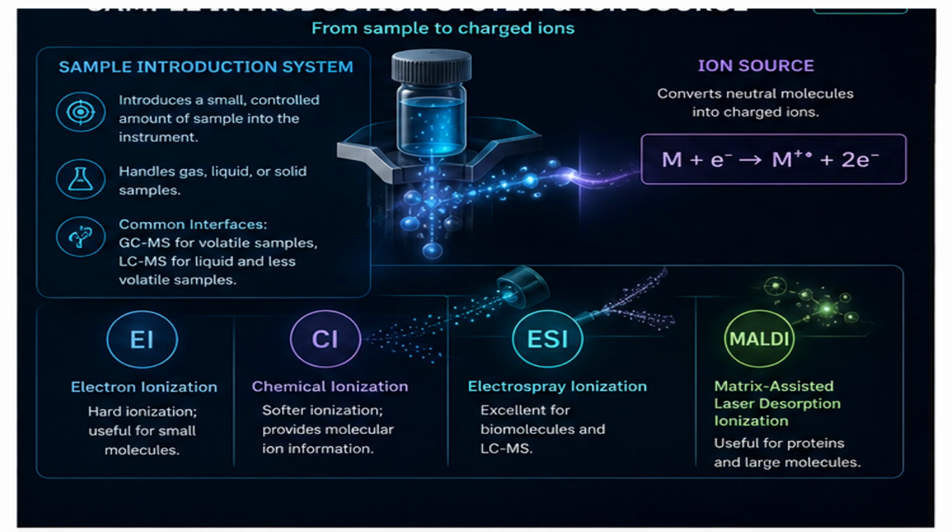Electrospray ionization, or ESI, is widely used in LCMS. It is excellent for biomolecules, peptides, proteins, and other large or polar compounds. MALDI stands for Matrix-Assisted Laser Desorption Ionization. It is useful for proteins, polymers, and large molecules.